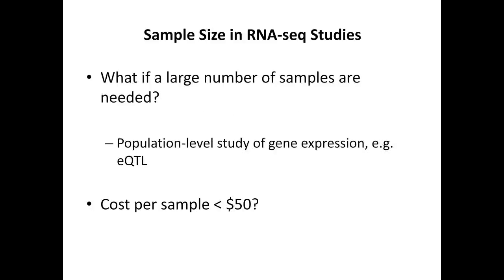When we need a large number of samples sequenced, for example, in population-level studies of gene expression, and those of you who are familiar with eQTL analysis, we need maybe 500, 600, sometimes thousands of samples. So the question was how we could do RNA-seq on a large number of samples, and whether we can reduce the cost to $50 per sample.